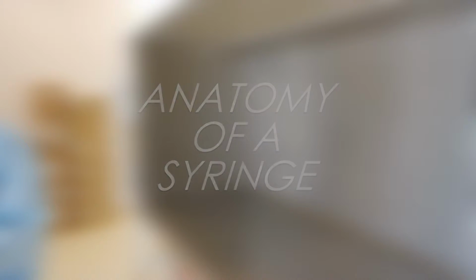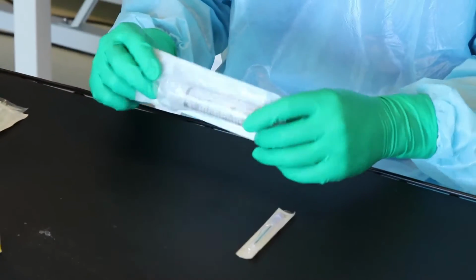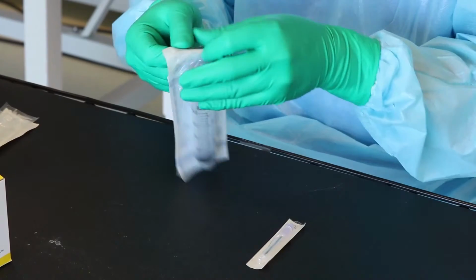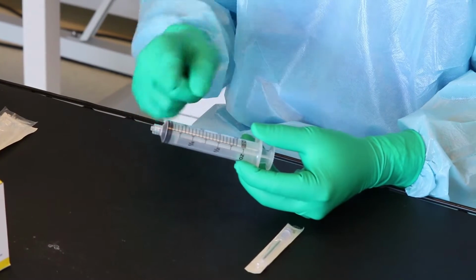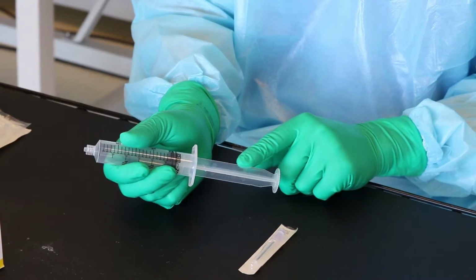So now that the hood is clean, we'll talk about the tools you'll be using. First is the syringe. Notice how it is packaged and sterile. When you open up the syringe, you'll notice a few things about it: the tip, the barrel, the plunger, and the volume markings.